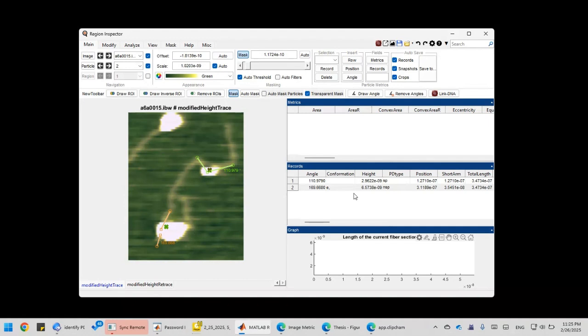And it's also linking two DNA together. So I may call it link, right? With a question mark because I'm not sure. It could be just one piece of DNA. So that's the additional conformation information that I can manually add. Now, if you want to add this column, you can simply type here and add your own column.